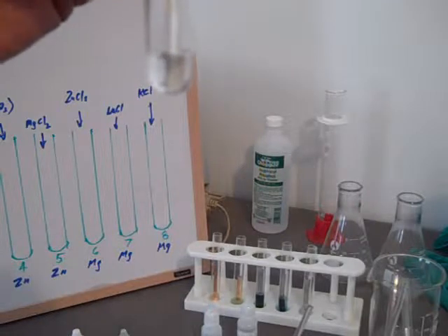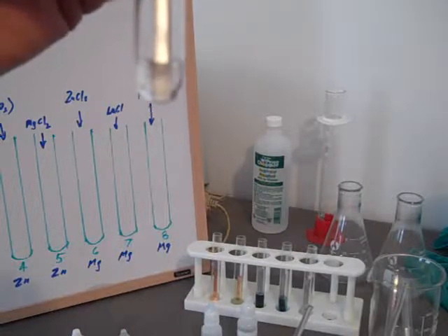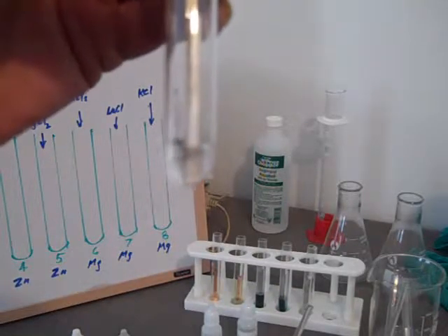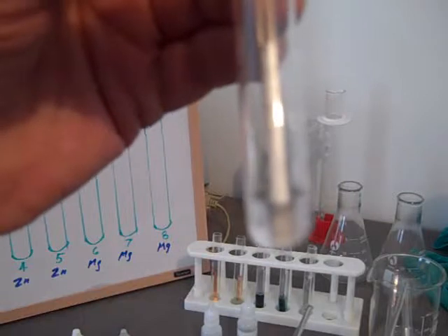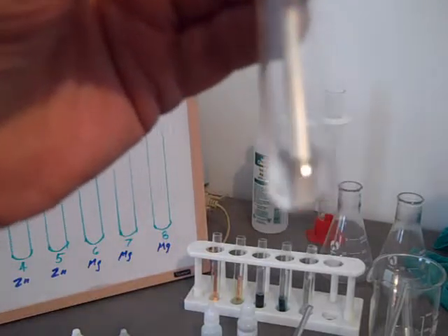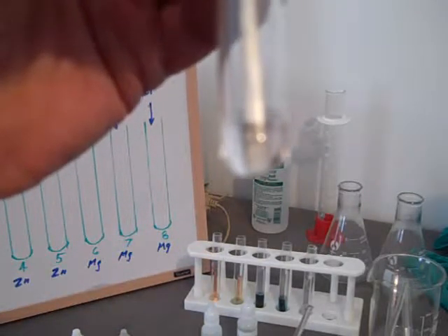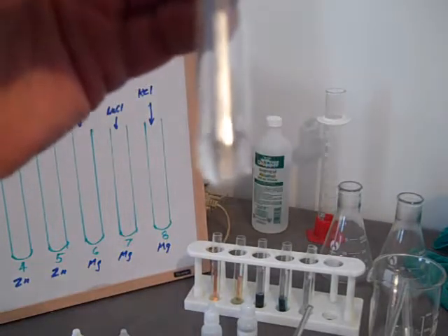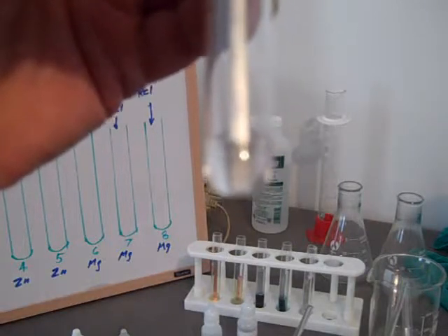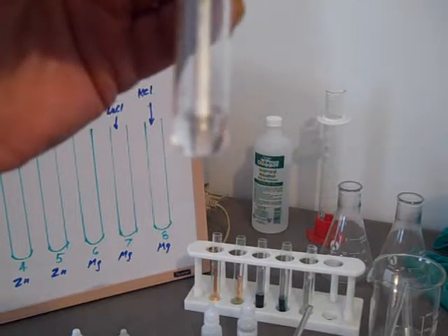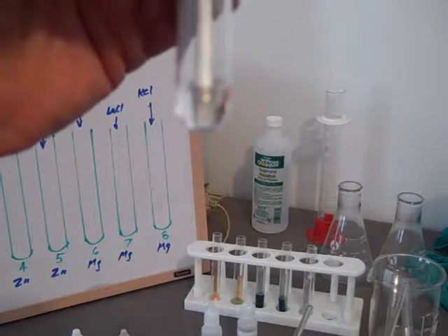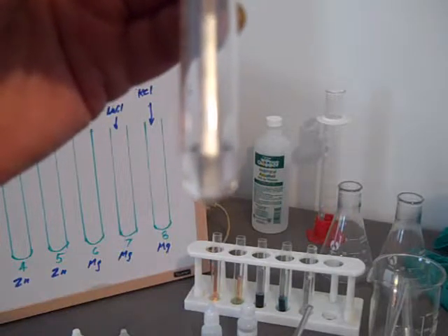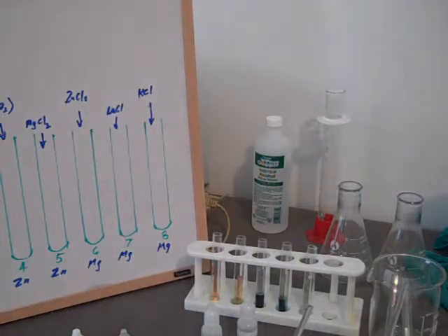I used to do a lot of electroplating when I was young. I see bubbles. There are bubbles appearing on the magnesium strip. Oh, we're into magnesium, right. So the magnesium strip is reacting. I don't know if you can see those bubbles. It's hard with this particular camera, I think, to get that fine of focus. But take it from me for now, this is verbal data, but there are bubbles forming on the bottom of the magnesium strip. Okay? That was number 6.